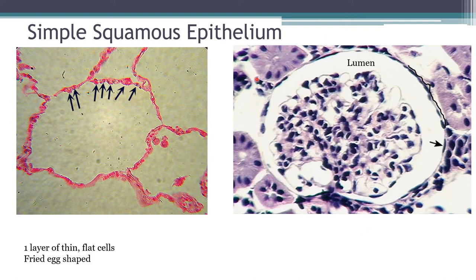This example comes from the lungs and this one comes from the kidney. Here your lumen is small — not big like in the previous image. You've got your lumen around the structure I'll call the cauliflower, and you see the white space around it — that's your lumen. The simple squamous epithelial cells are the thin, flat cells lining the outside of that lumen. I drew a black line to give you a boundary for where those cells end. You can see they are incredibly thin and flat, with really only one layer — so this is a simple squamous epithelium.